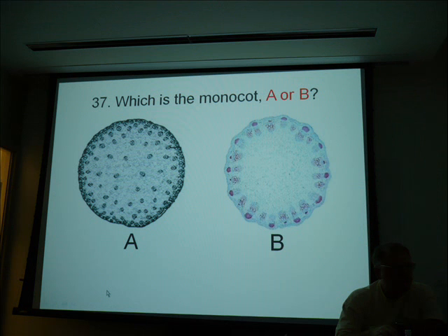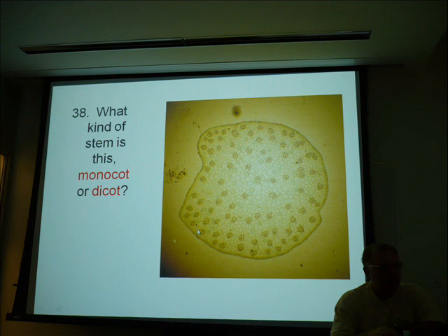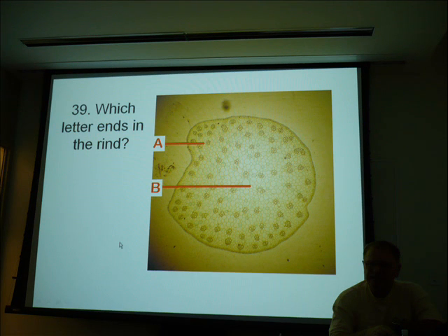Now you look at these two pictures, which one's a monocot? Yeah. Because he has no pith. He only has parenchyma. This bad boy's got all three of them: collenchyma, parenchyma, and sclerenchyma too. What was that one? They're scattered. Monocot.